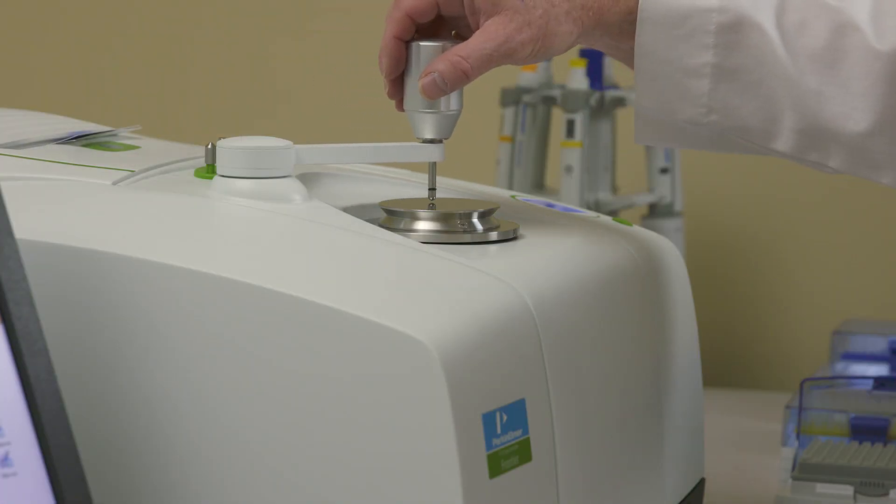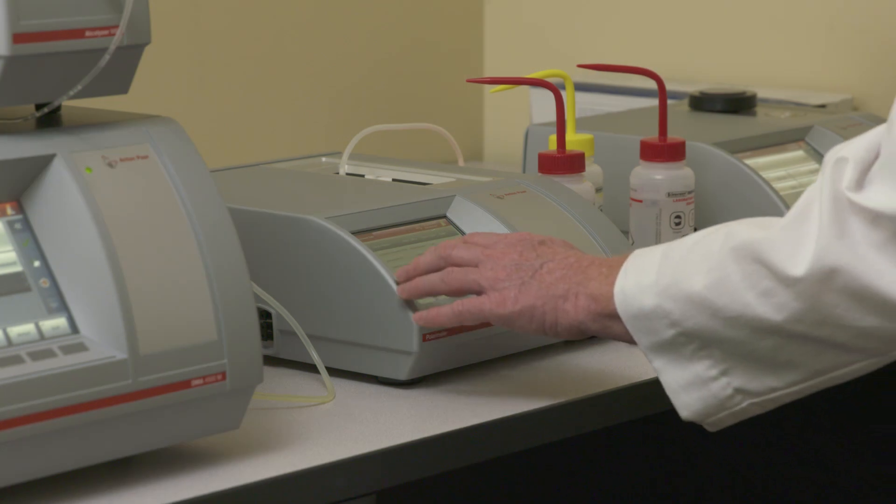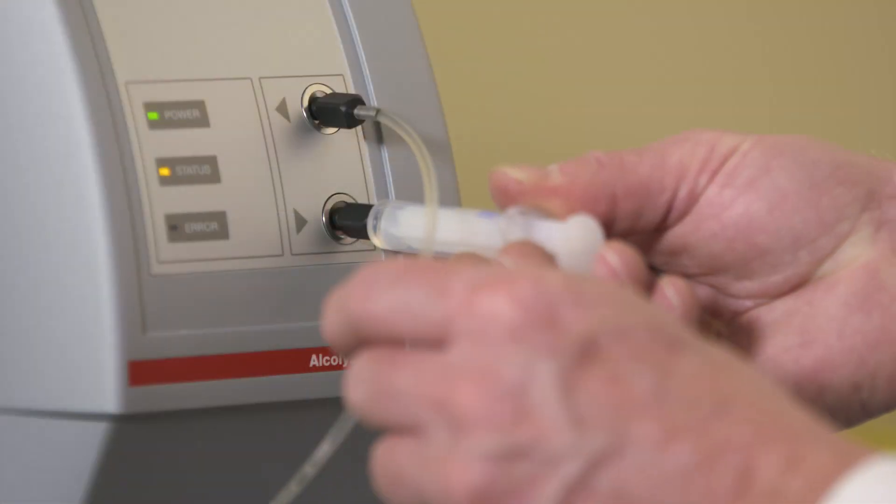In science, no one test is definitive. It is always better to use multiple tests to confirm results. This is more work, but we are dedicated to this comprehensive testing process to validate our Seed to Seal commitment.